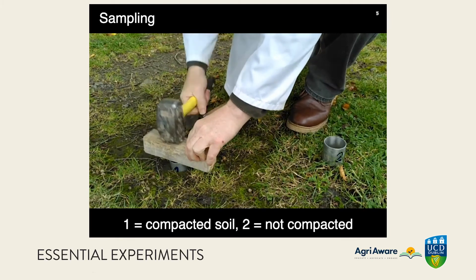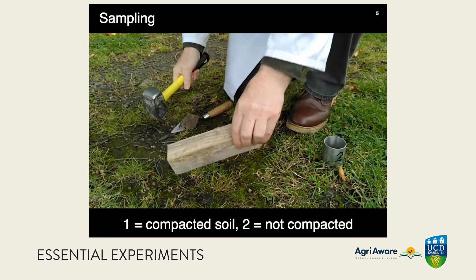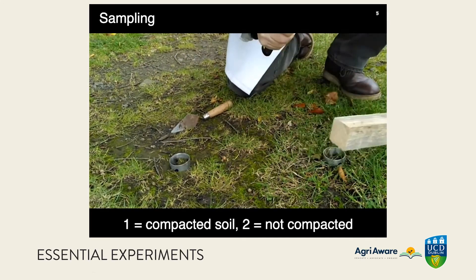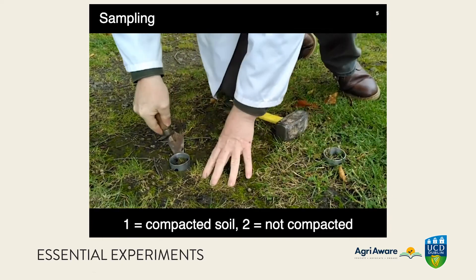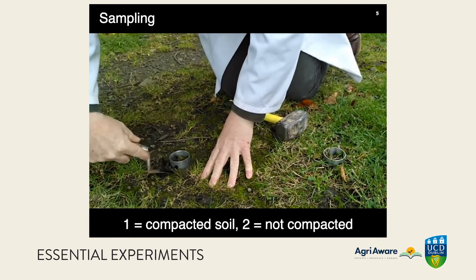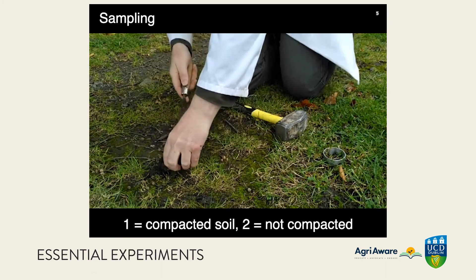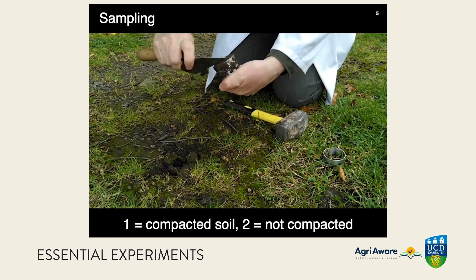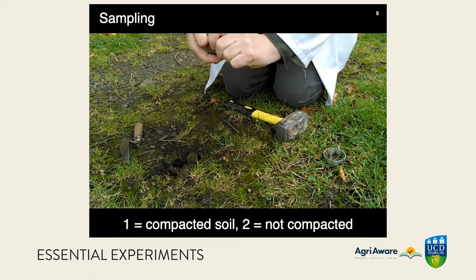The ring is driven into the ground — not all the way, leaving a space at the top for this exercise. Then the sample is excavated. Note that it was harder to dig up than expected — of course, the soil is compacted here. Then we scrape off the excess soil flush with the base of the ring, cleaning off the surface on the outside.